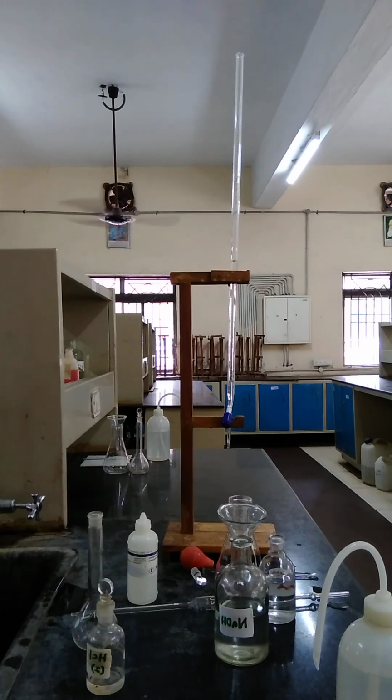We will not be able to guess the normality, because what we took was 0.1 normal oxalic acid, and then we standardized the sodium hydroxide. We don't know how much normality they have given for the other solution. But it took 25.5 ml to neutralize 20 ml of 0.1 normal oxalic acid.